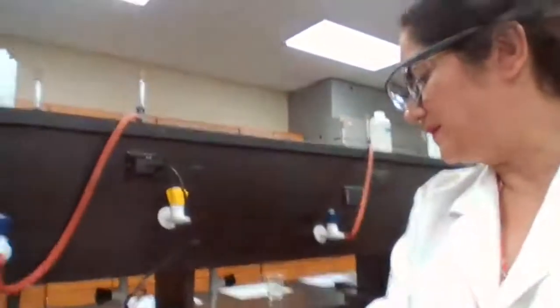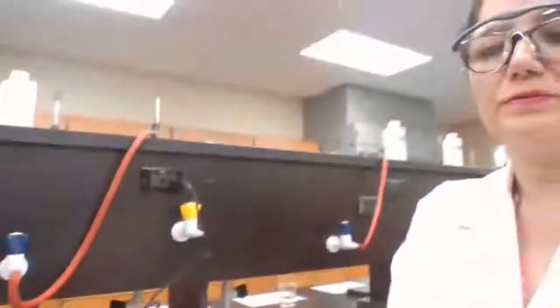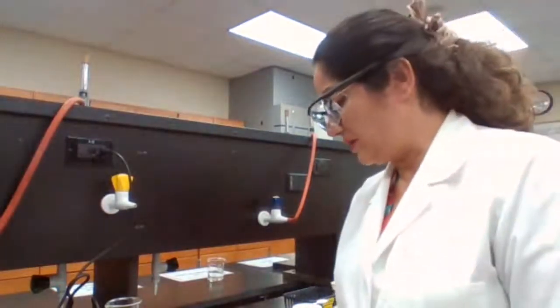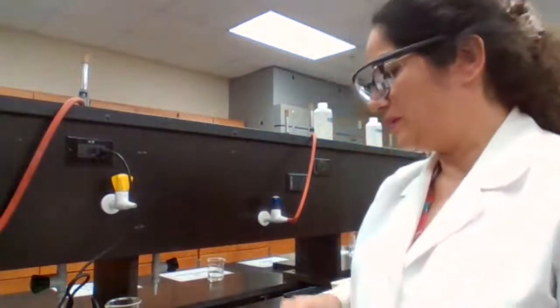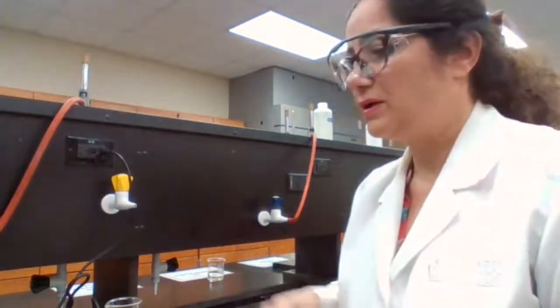So you record the mass of the beaker as 65.550, and the unit is gram. Based on the significant figures which you read in the introduction, all the numbers shown on the balance, which shows the accuracy of this device, need to be recorded.